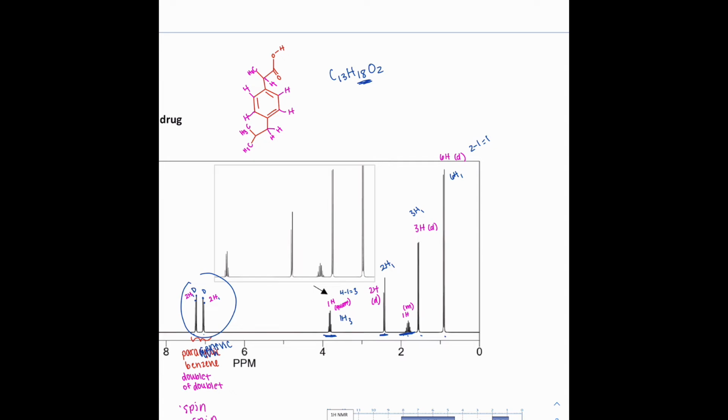So looking at our structure, where do we see that occur? It's not super downfield, it's not super upfield, but aside from that para-substituted benzene, it is the most downfield signal. So that is going to have the most electronegative effects, likely from that carboxylic acid that we see at 11 ppm.